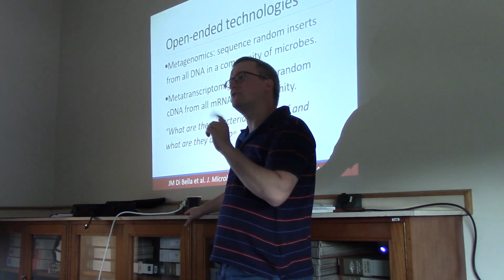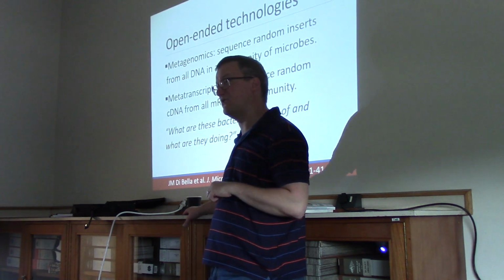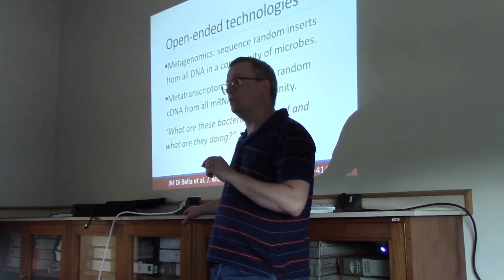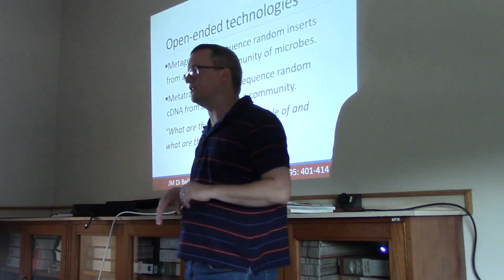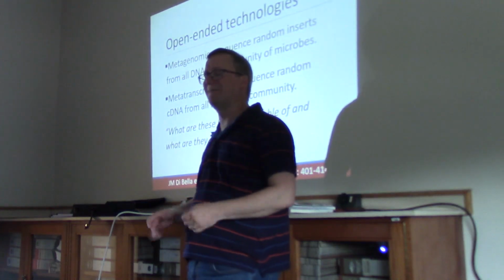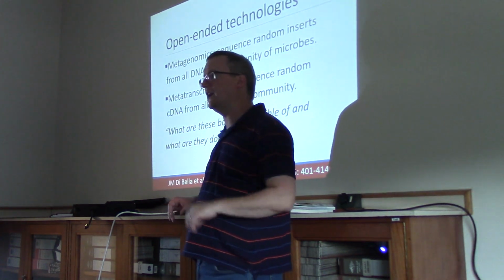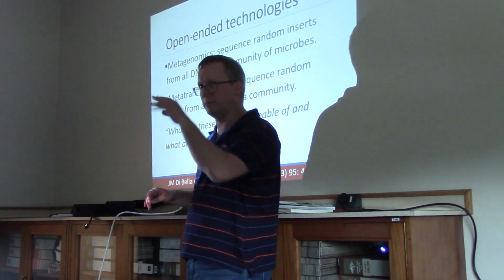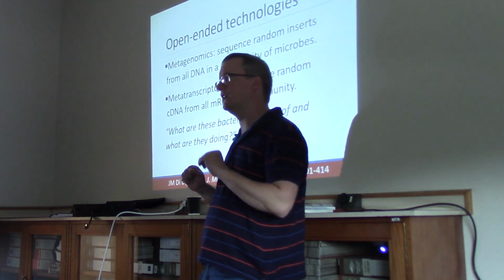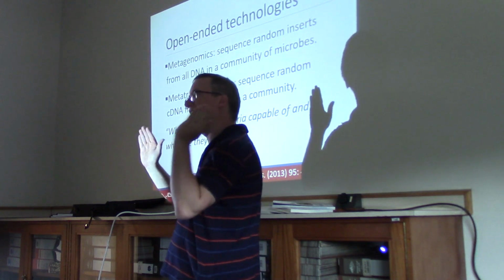All right. So I wanted to suggest the possibility of the second half of what we talked about on Monday, gene assembly. It is possible to do a mapping to major players in the sample and maybe account for 20% of your data, possibly. That's a very big number. But let's say some of it maps to E. coli and some of it maps to Bacillus subtilis and Staph aureus and so on. Big, well-characterized, very common bacteria. We can then say these reads have all been accounted for. Let's look at everything else.